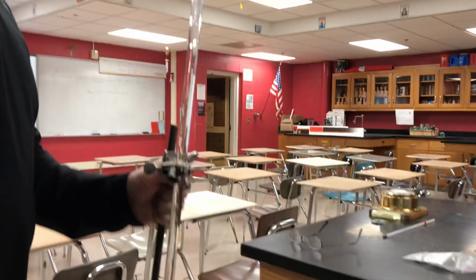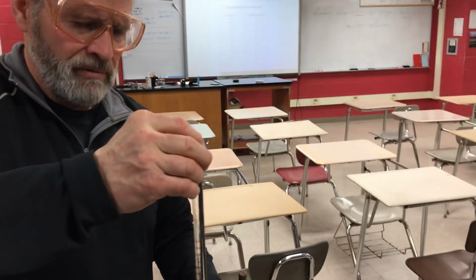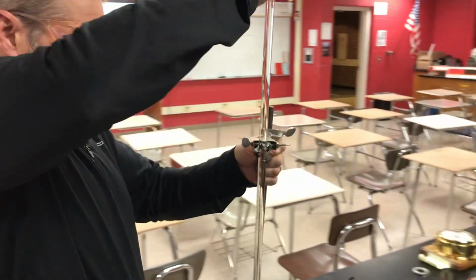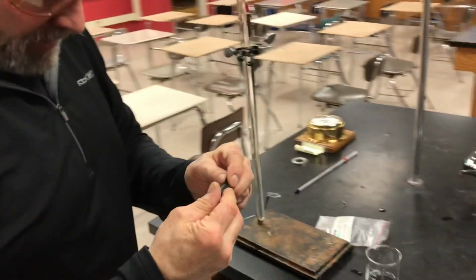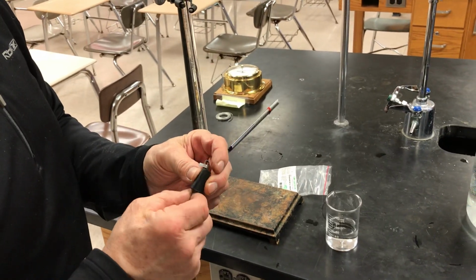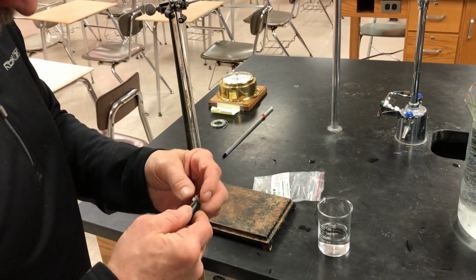Okay, now I'm going to insert the stopper with the magnesium. Set this down here. This is the tricky part. It's not cooperating.